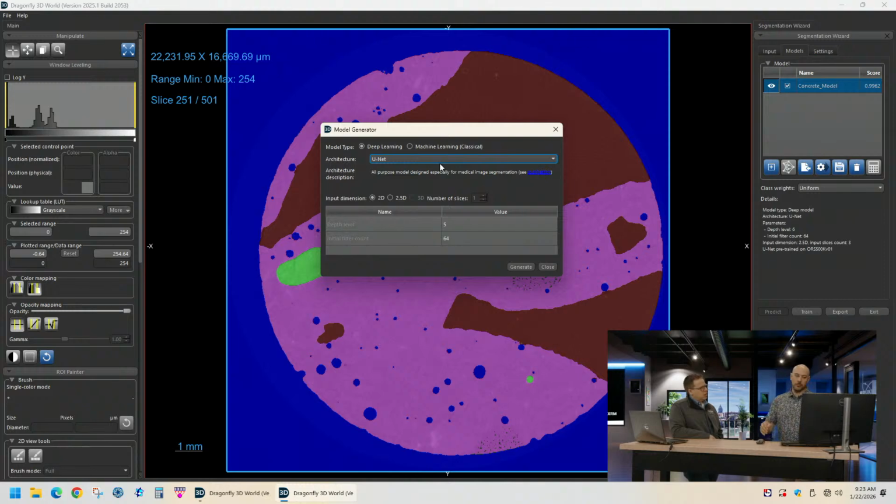So it's like you have a new colleague at work, and it's their first day. Right. And the model is just kind of that new colleague. So they might have some basic idea. These different models have a basic understanding of like, it's a picture. But they don't know anything about this material. So we're going to have to train it. We're going to have to tell it. Right. This is a class. You have to tell them what's what. This is the matrix. This is that. And we have to be very careful that we're telling them the truth. Exactly, yeah.